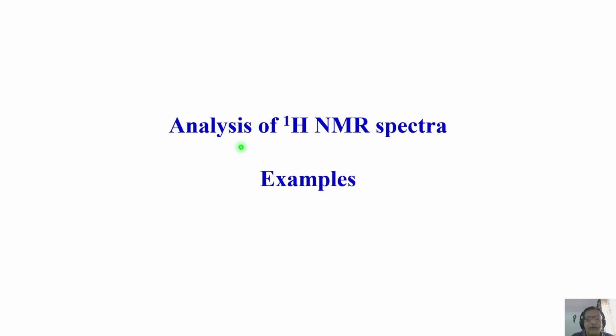And also we discussed what happens to the Pople nomenclature when there are chemically equivalent nuclei, when there are more spins present, groups of equivalent spins like CH2 group, CH3 group, etc. How to represent them by Pople nomenclature. And we took one or two examples of analysis of such spectra like AX, AB, A2, AMX, and quickly we saw some of the analysis of the spectra of AA'X, AX2, etc.